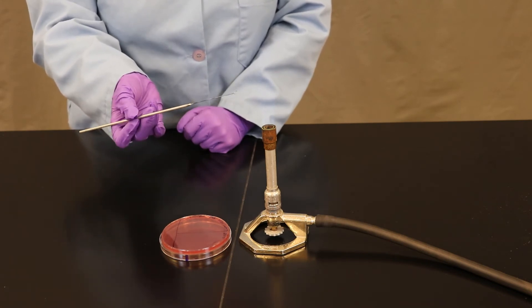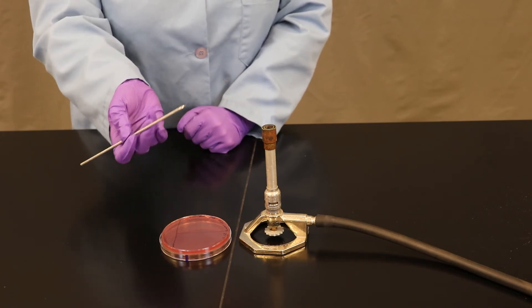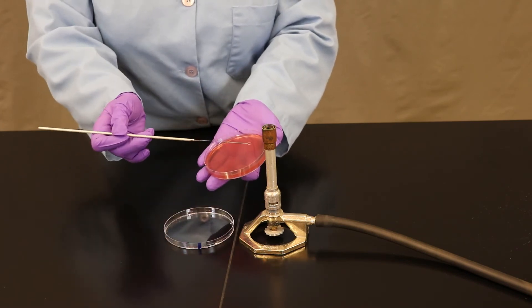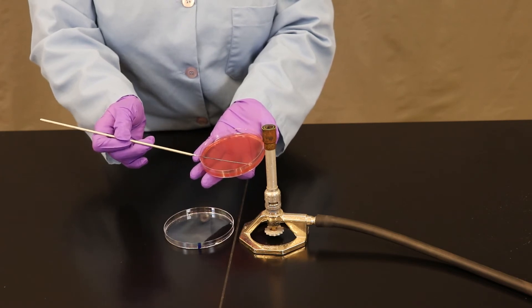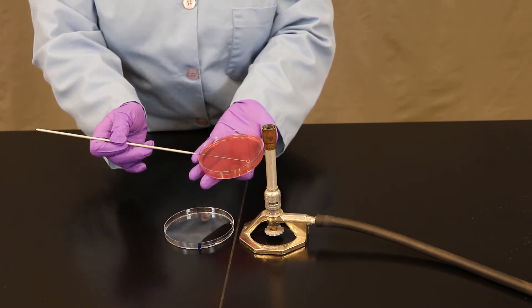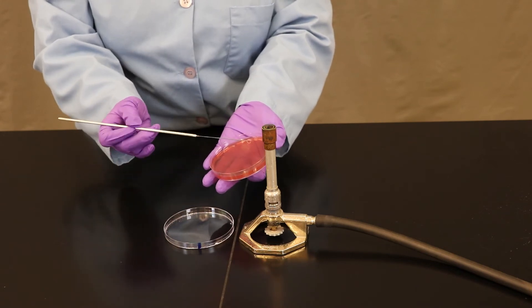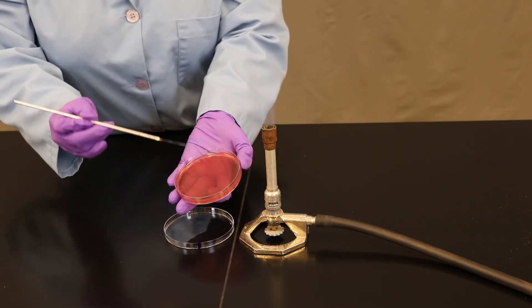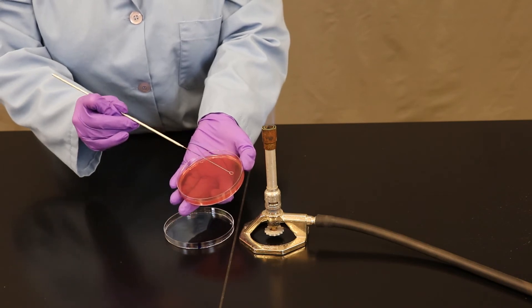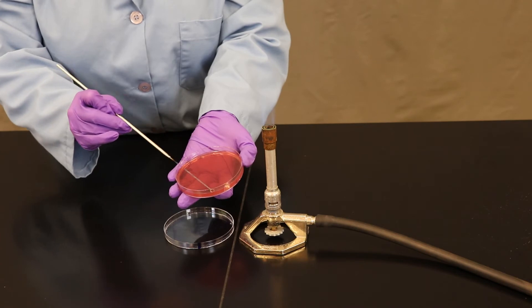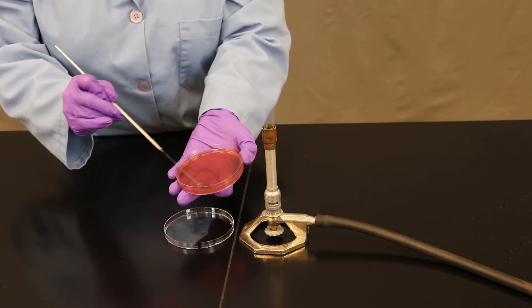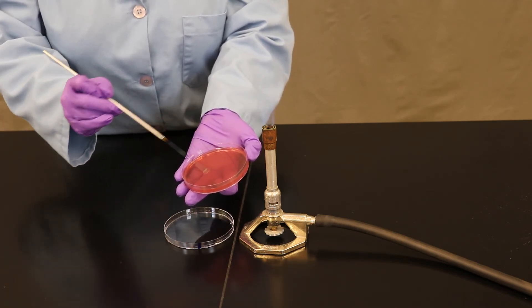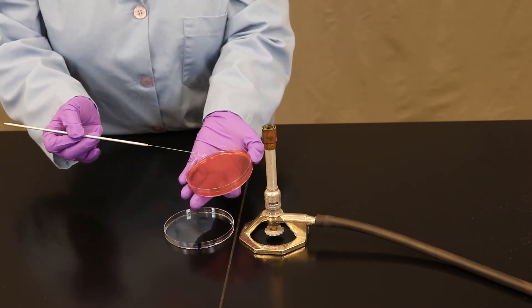Allow it to cool. I typically like to hold the loop close to the Bunsen burner. Many microbiologists will touch the loop on a clean portion of the petri plate by tapping it down, making sure they don't hear a sizzle, making sure they don't melt the agar. Once you're sure that it's cool, you're now going to physically touch down into the first zone where you place the bacteria, and you're going to begin streaking back and forth. You have a lot of surface area to work with, so the more you streak back and forth, the better. We'll show you what the final result looks like afterwards.